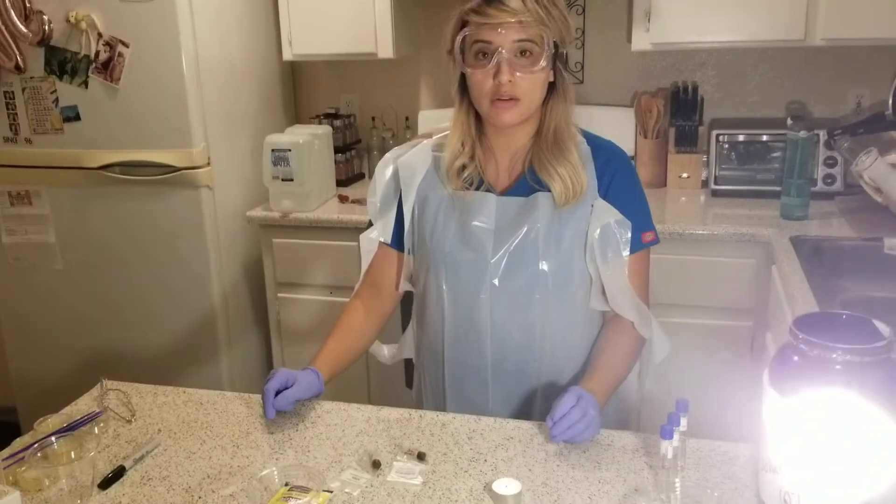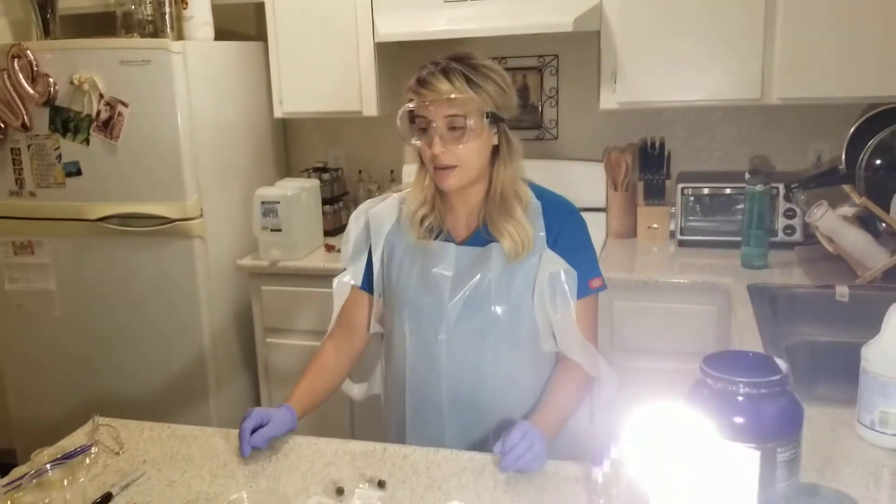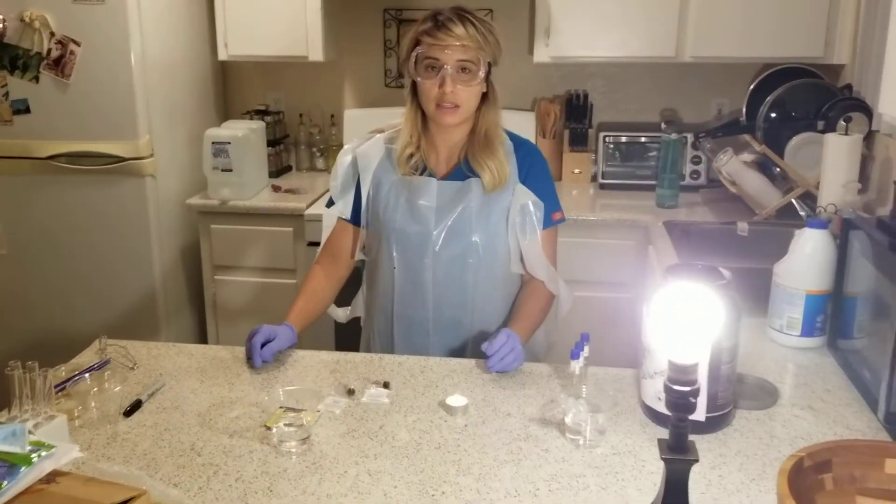Hi, my name is Alicia Cota. This is week two of Bio 225. The lab experiment for today is antiseptic techniques.